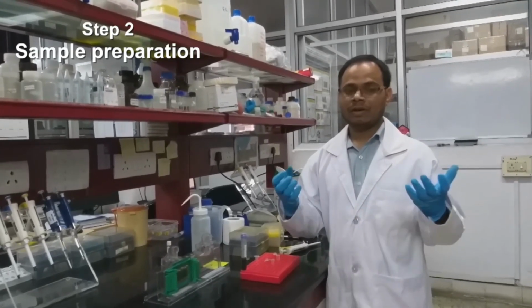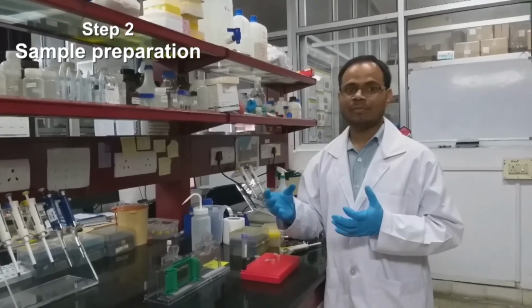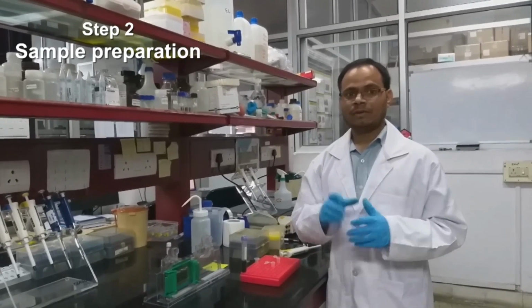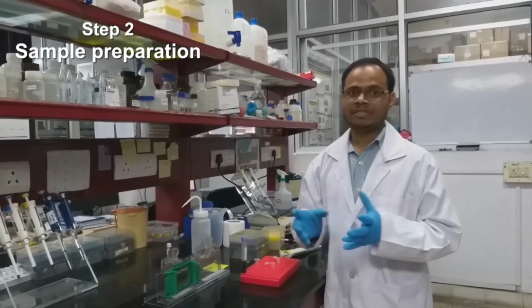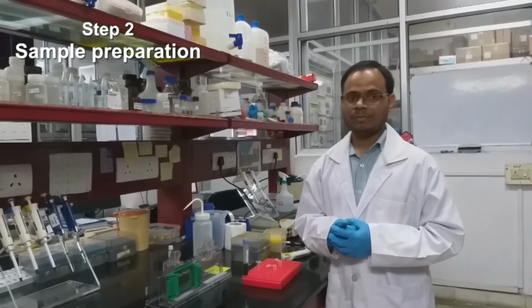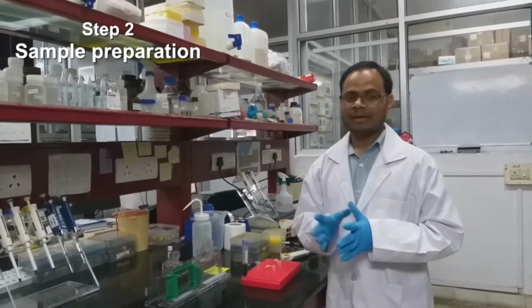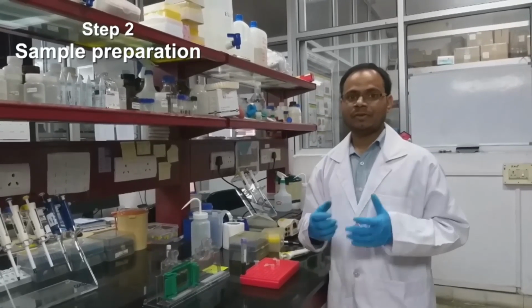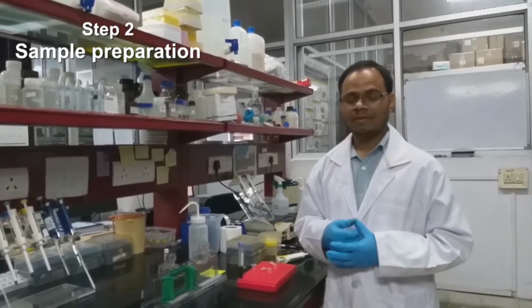If you have a dimer, you can see it as a monomer in SDS-PAGE. Suppose you have a 20 kDa, that means a 40 kDa protein, which is a dimer actually. You can see only a 20 kDa band corresponding to that protein, because DTT breaks down the disulfide bond and you can see only a single band. If you want to see the actual molecular weight, you have to run it on native PAGE where there is no reducing agent or no detergent.